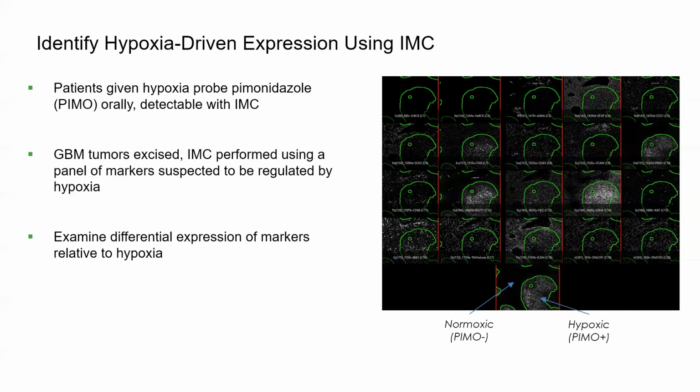So I might throw around a lot of hypoxia terminology, but by all means, it's probably not the most important thing relative to this presentation. What I really want to outline is aspects of this pipeline that would be applicable to your project. One aspect applicable to a lot of projects involves cell segmentation and classification. So those are what I will be spending the bulk of my time during this workshop discussing and elaborating on.